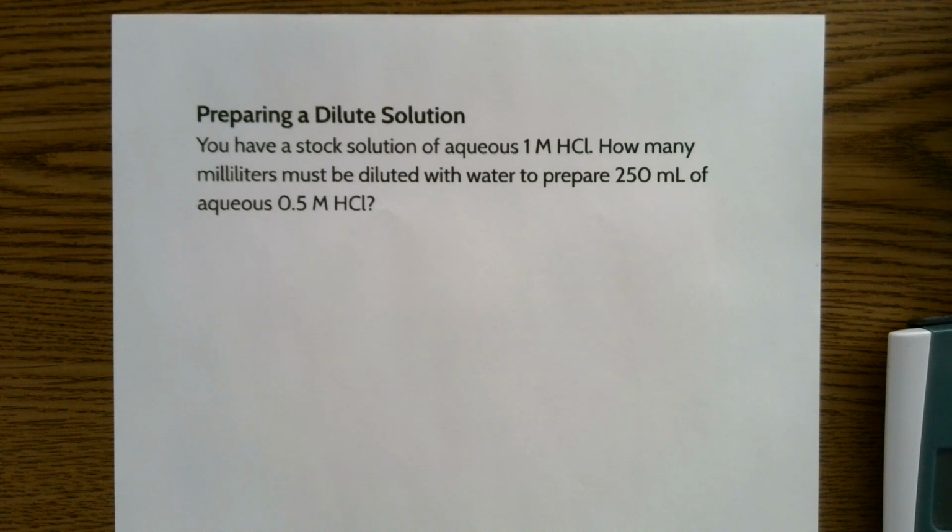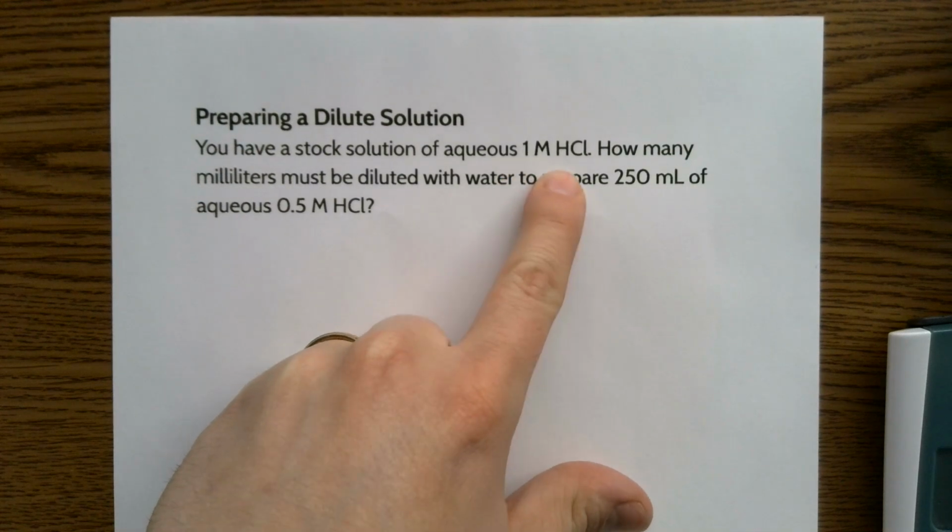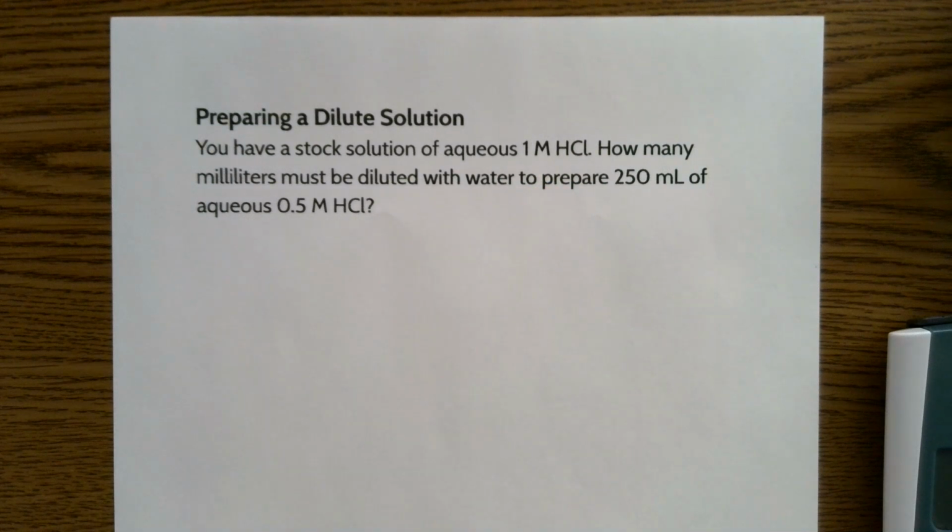So what I like to do is dilute the solution down to a desired strength so that we can use it in class. We want to use a 1 molar HCl, not 12, right? We need to dilute this down a little bit, okay? Now, how do we do that?